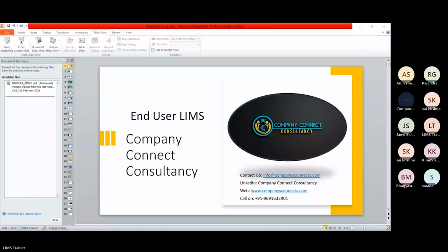Yes, please. So the agenda is clear, like what we are covering in this demo lecture, right? Yes. Okay, okay. So let's go ahead.